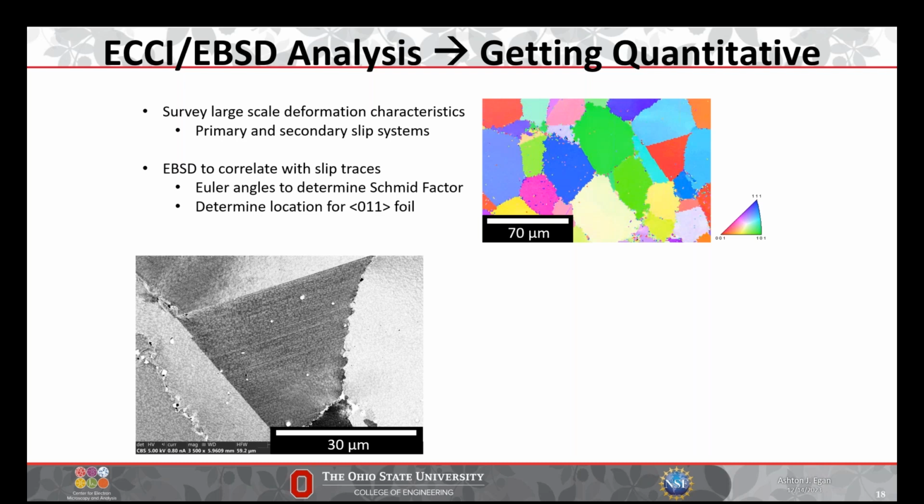Okay. Why don't we observe the beta phase in titanium EBSD? So in this one, it was a low beta kind of heat treatment, so there wasn't much to observe. And also, as such, I didn't index it. I only chose alpha as the one that I was indexing, knowing that there wasn't beta there. That's basically the short answer.